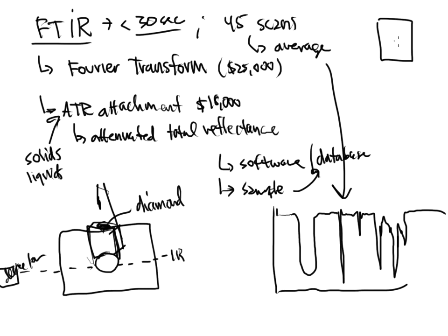So a cop could take this solid sample, bring it into a lab, and you could run it on an FTIR. And in a matter of 5 minutes or less, you could put that sample on an ATR attachment, scan the sample on the FTIR, cross-reference that picture to the database that's on the computer, and the computer will kick back and say, "Oh, this is cocaine, it ain't powdered sugar." It will actually identify it. It will give you a name.